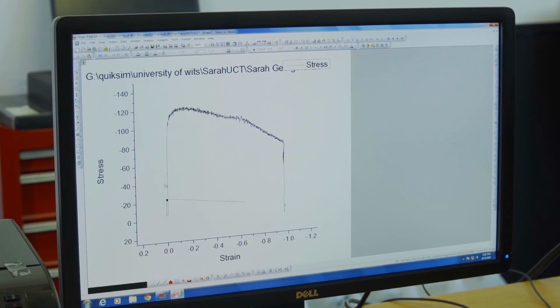At that temperature, we have an initial increase in flow stress, then you reach a peak before softening takes over, and you see continuous flow softening until the final strain was obtained. And like it showed on the console of the machine, we couldn't achieve the strain of 1.0, we did achieve 0.98, which is close to 1.